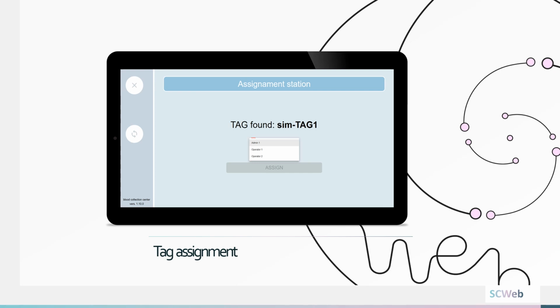An assignment station in each work area will attribute each user with the programmed activities on the specific checklist. If required, be it for legal or organizational reasons, these checklists can be programmed for each single user.